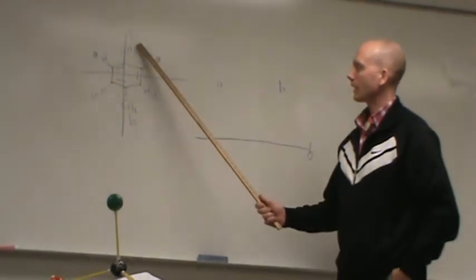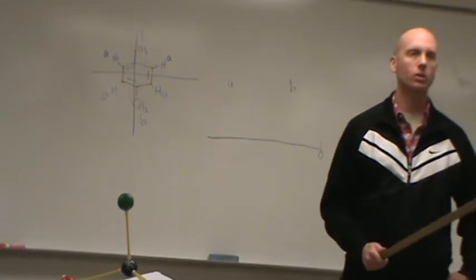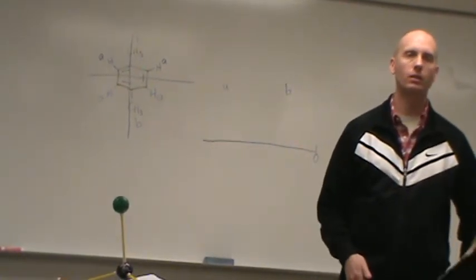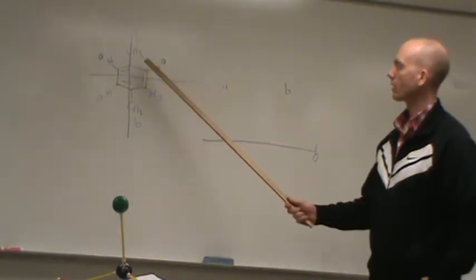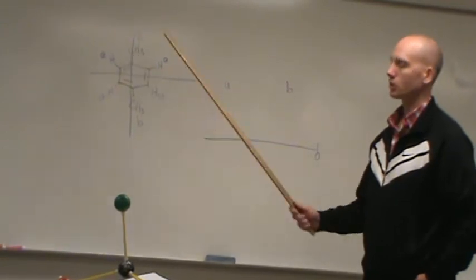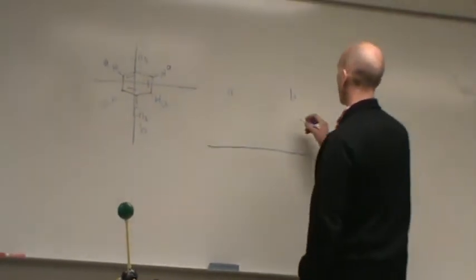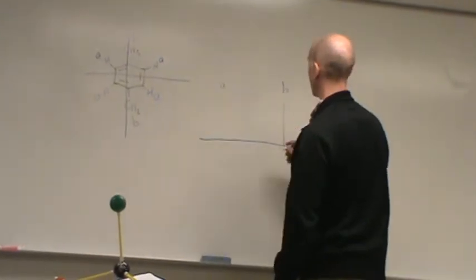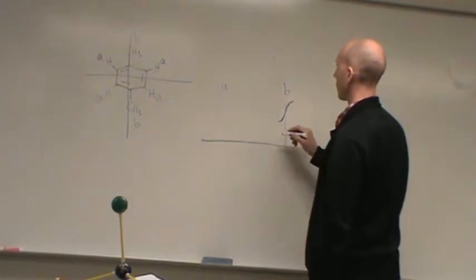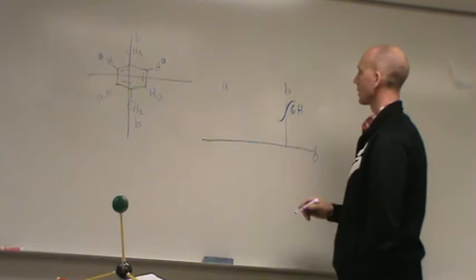So back to B, what will the signal look like for B? A doublet, singlet, triplet? What will it look like? A singlet, right? Yeah, that's right. There's no hydrogen there, is there? So N is 0. So B will look like a singlet. And that will represent how many hydrogens? 6 hydrogens.